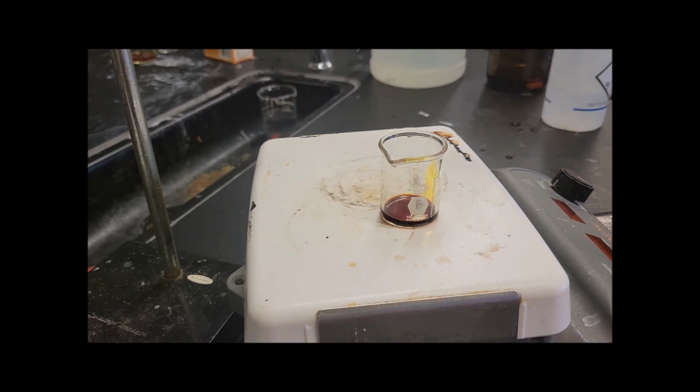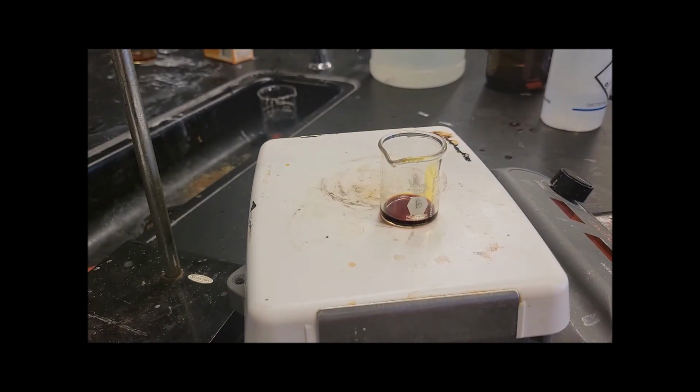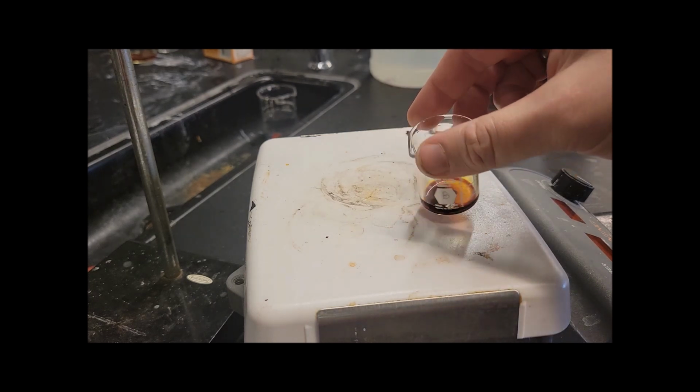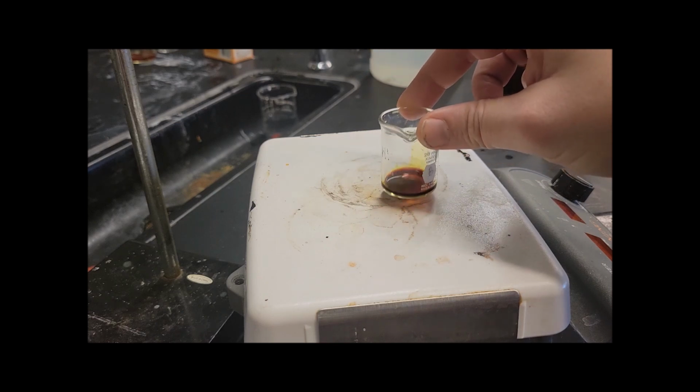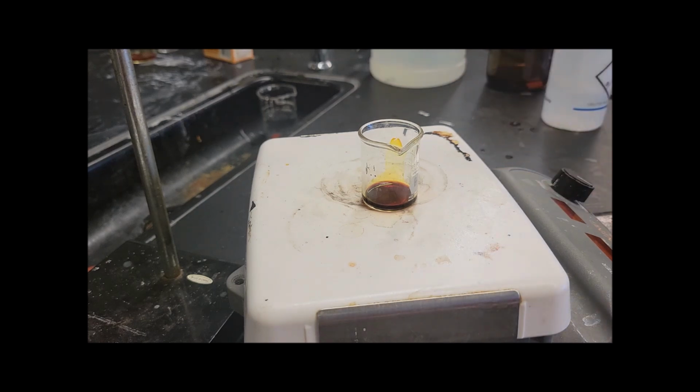There's the iodine tincture. Now, it says to use galvanized nails or galvanized tacks. Rather than that, I'm going to try to use powdered zinc. Let that go. See how well it goes. I might have to add more. We'll see how it goes. Now it's just a matter of waiting.